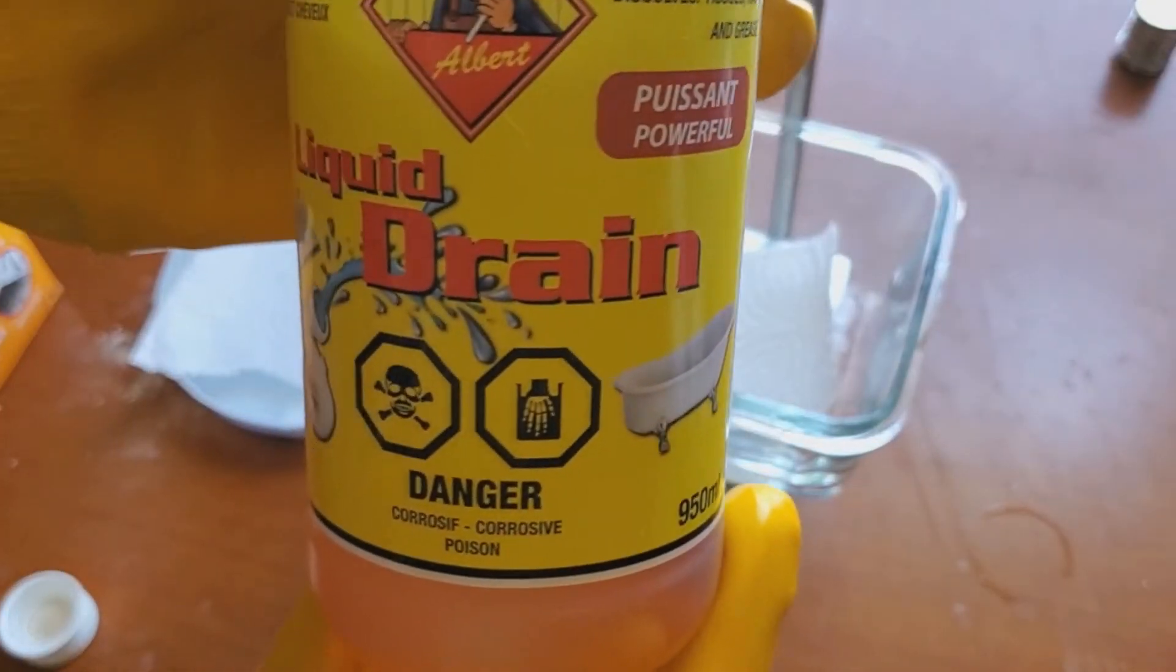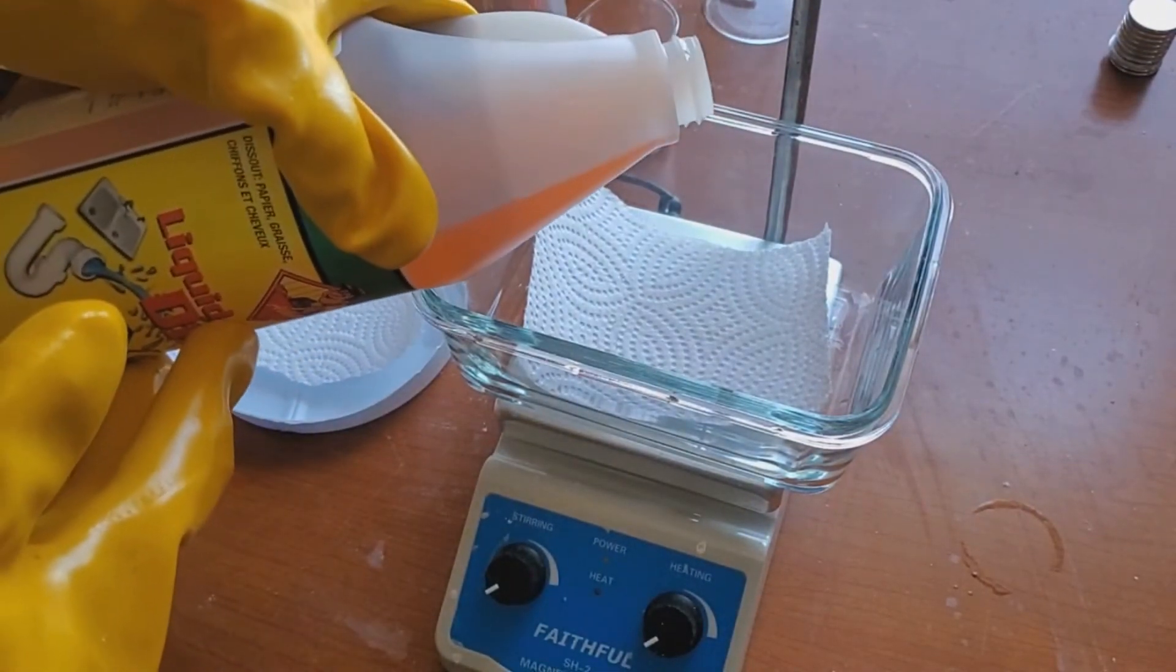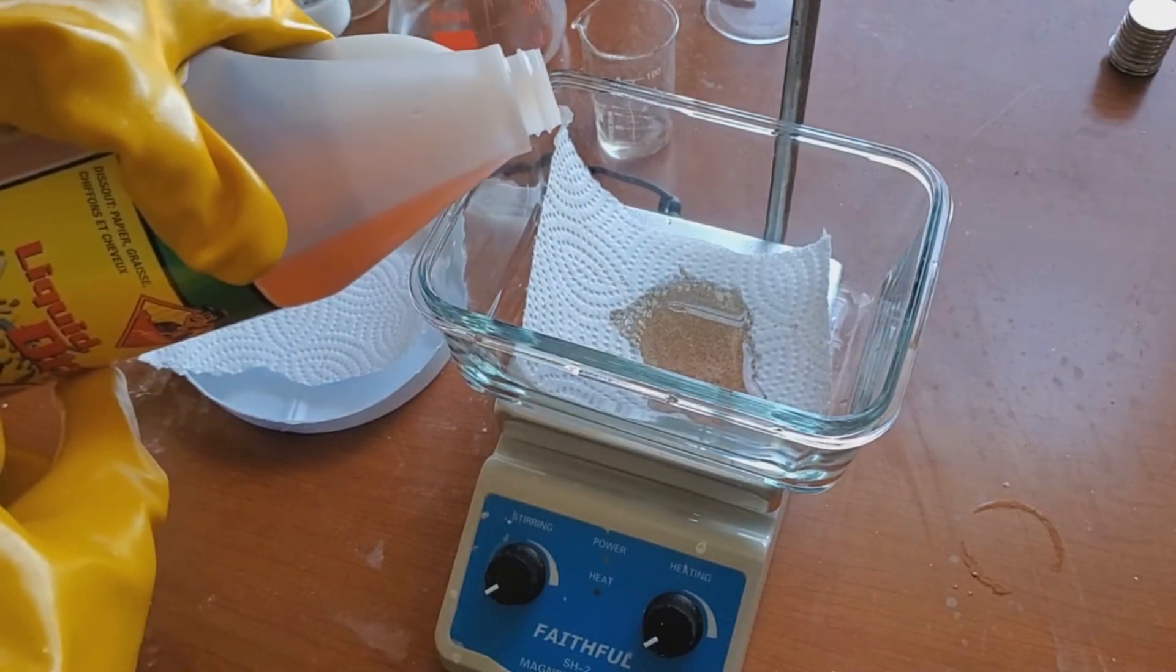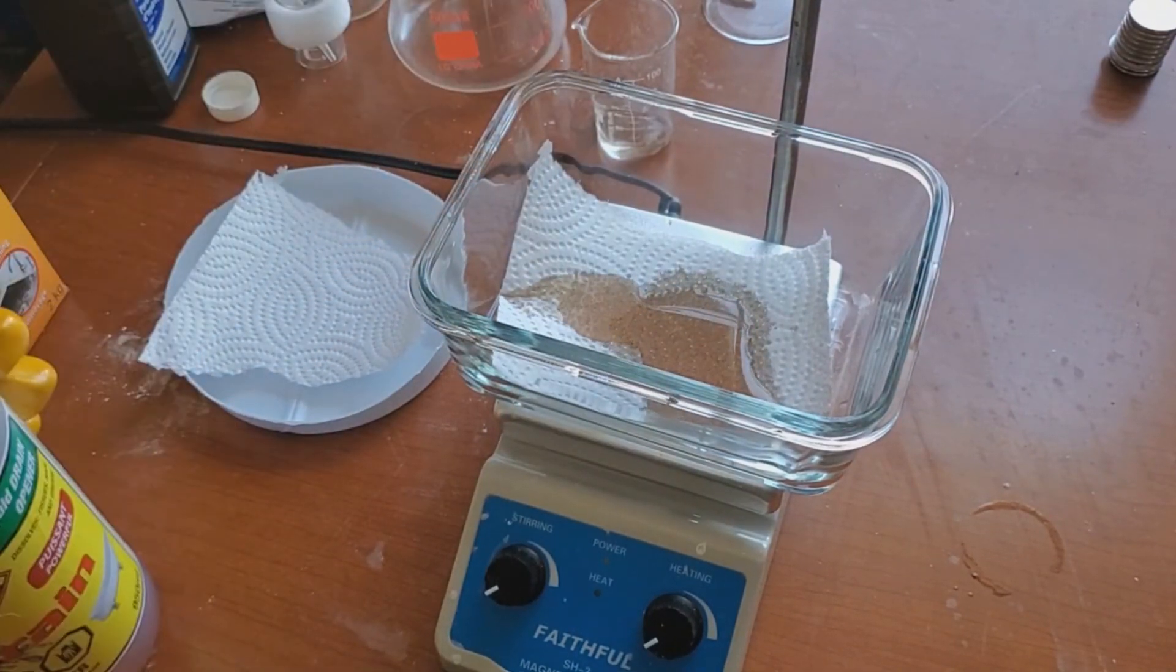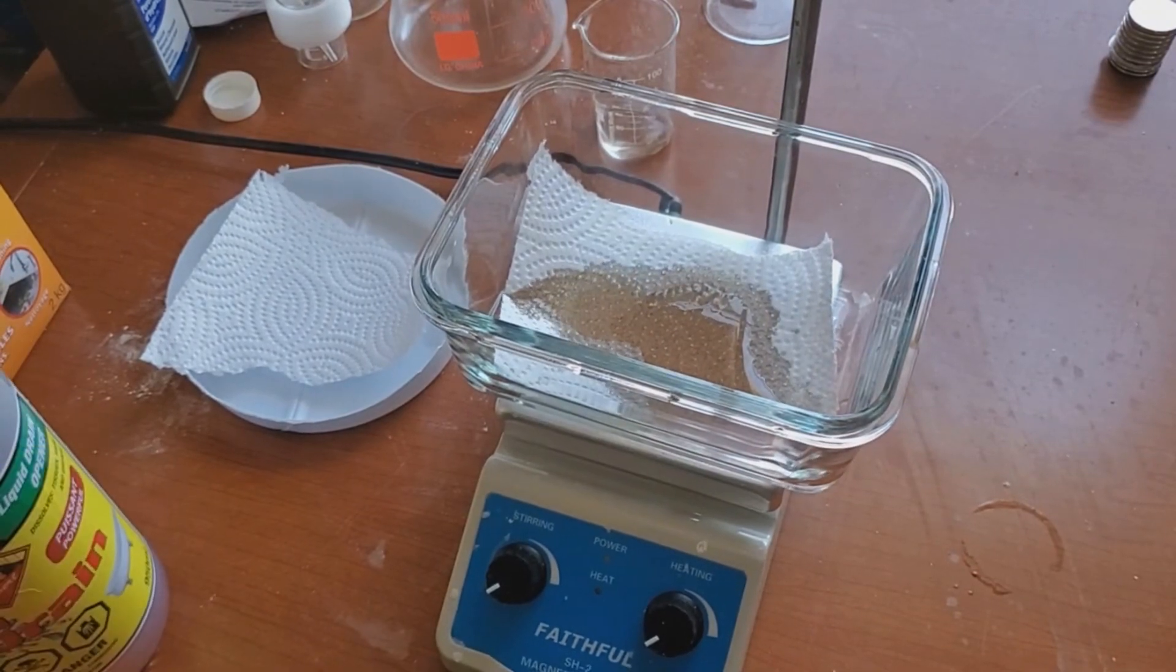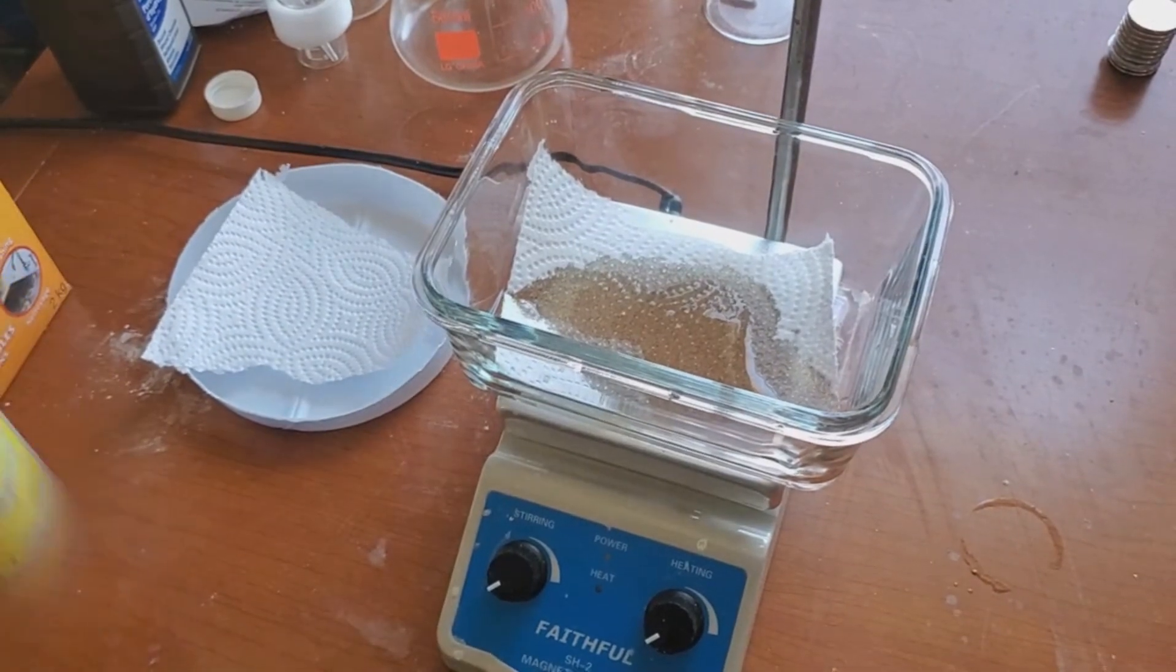We are going to show the difference between the drain cleaner we started with and the Caro's acid we end up creating. I started with the drain cleaner just to give it a little bit more time to react with the organic. And on the left, I cut the bottom of a bottle of bleach and gave it a good cleaning. Bleach bottles are made from polyethylene plastic and can withstand concentrated acids, even concentrated sulfuric acid.